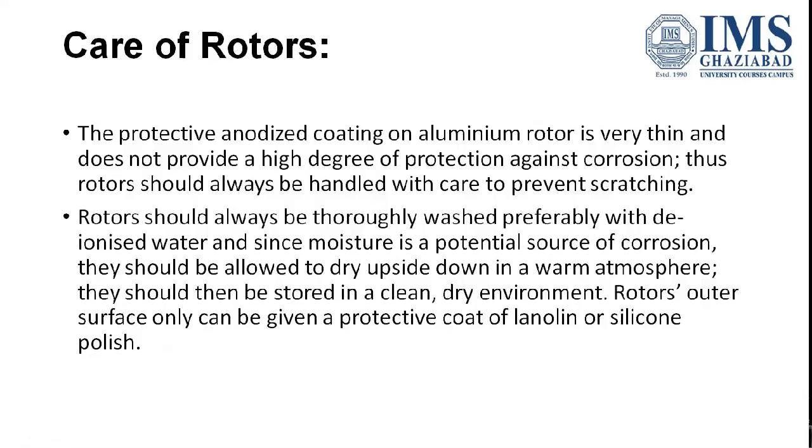Coming to the care of rotors, these are usually coated, and coating is needed because the sample can always spill, and so there can be corrosion. So to avoid this, these rotors are usually coated. However, when you're using your centrifuge instrument, you should take care that your sample is duly filled to the appropriate position depending upon the capacity of your tube, and it should always be covered, and you should use tubes which can always be closed.